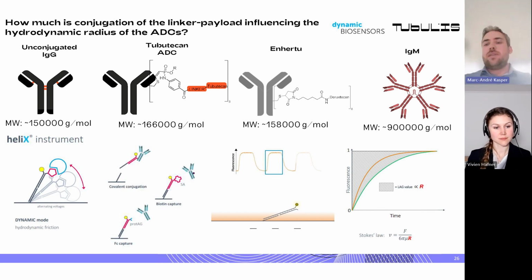And the value is, so here we see this relaxation, so after the molecules were taken to the surface and they relax, the longer it takes, the larger the hydrodynamic radius, and there's something that was defined by Dynamic Biosensors, which they call a lag value, and this is the area above the curve. So it just means what we need to know for the next slide: the larger the lag value, the higher the hydrodynamic radius in the end, and this is something we do not want to increase.